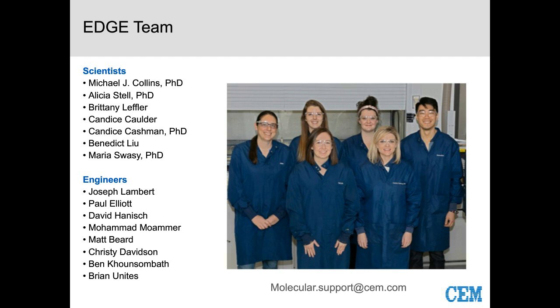Yeah, that is a great question, and to be completely honest, I hope to have that data in this presentation. Again, this is a preliminary study, and that's what I had at this stage. That is very much our next step, to run the packaging and look at that. I did mention we use that exact same method for the soil, the cucumber, and the packaged food.